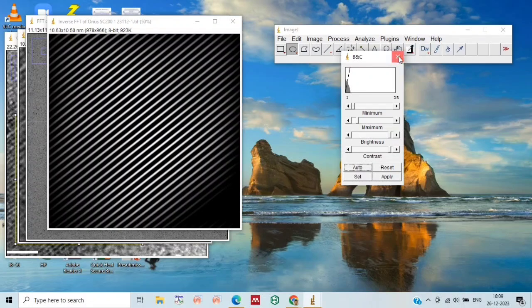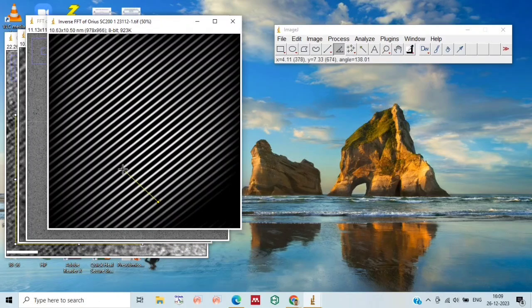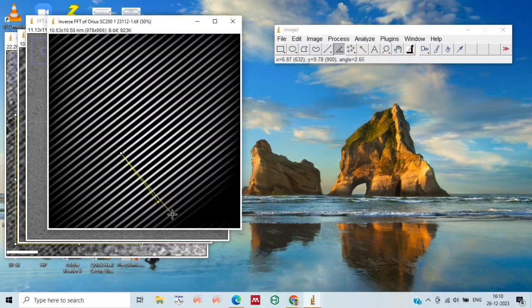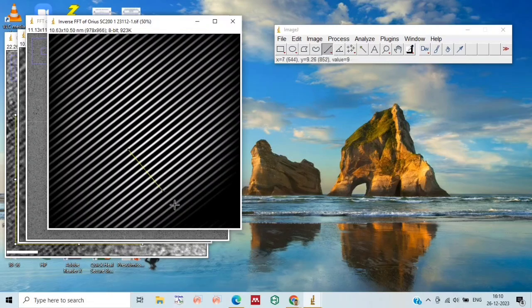Now just draw a perpendicular line by selecting the line tool over the d-spacing lines, in this way. And that's all — that's all for this measurement.